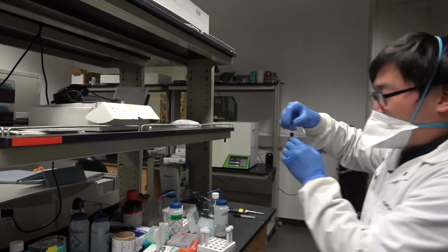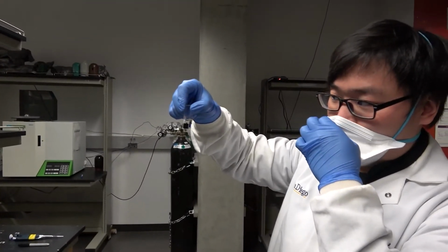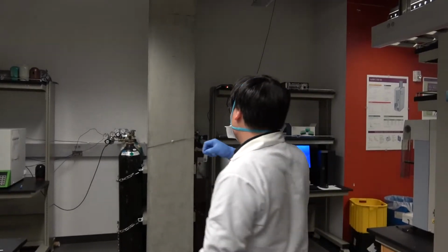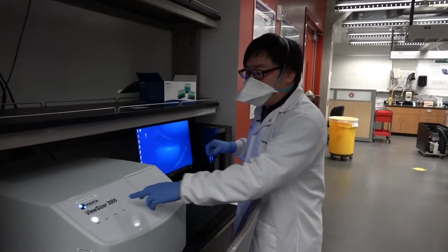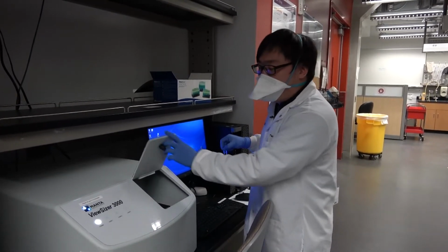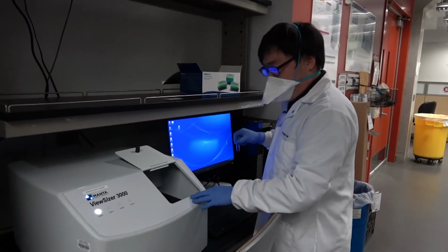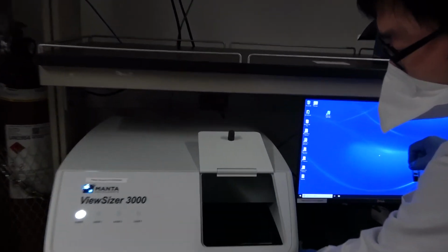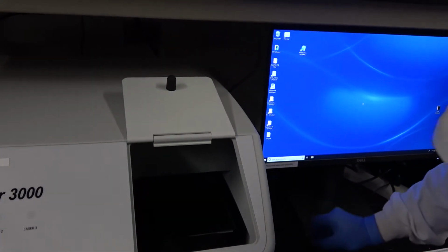Okay, next step, I will insert this cuvette containing the particle solution into the instrument. This is called the ViewSizer 3000, provided by Horiba company. And we want to show you what the inside looks like.